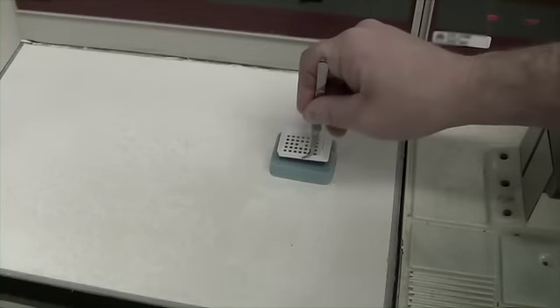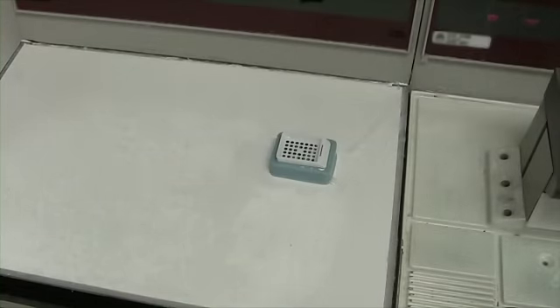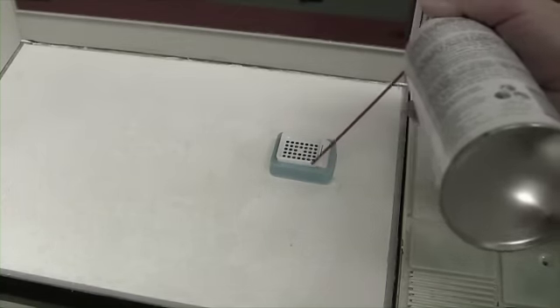I'm using freeze spray here around the cassette. This creates a paraffin seal so that the paraffin doesn't drip out, because you need to fill the cassette to the top, and this will give you a good solid block for making your tissue microarray.